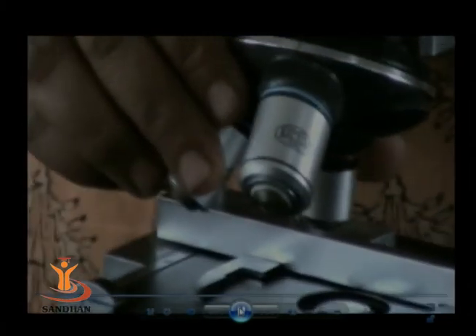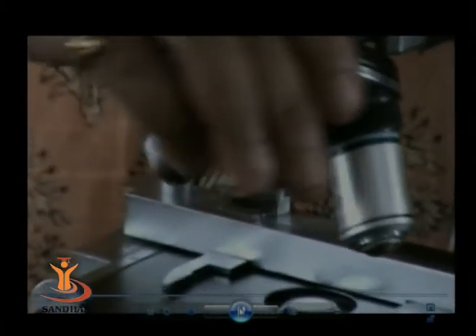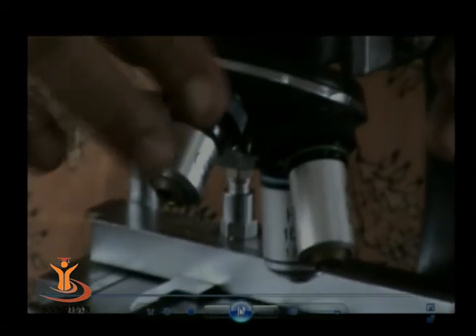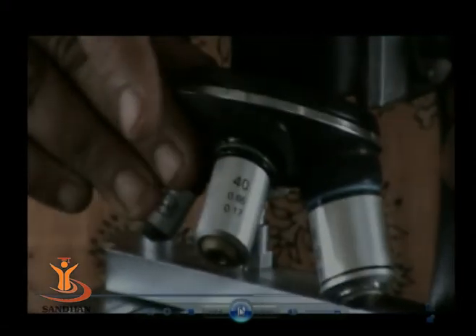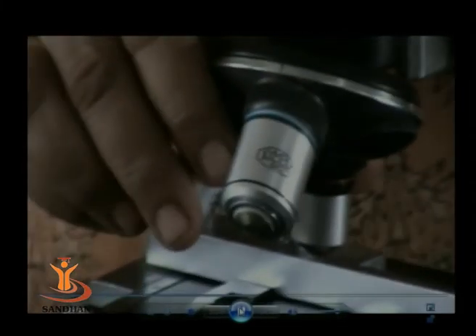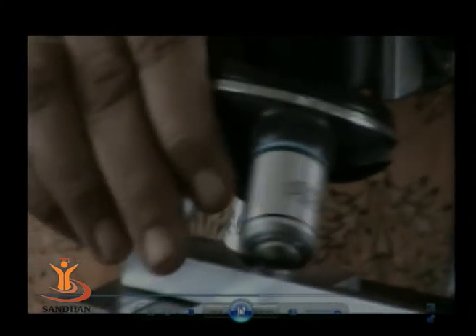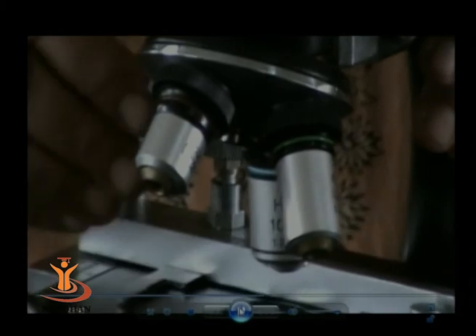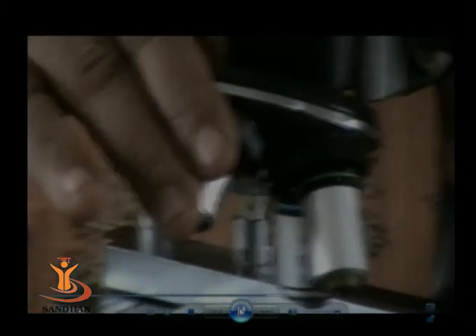This one is the high power objective, and this is the oil immersion objective. As you know, the three objectives have three different magnification powers. Low power has 10x magnification, high power has 40x, and the oil immersion lens has 100x magnification. This is called the objective lens because it remains close to the object that is mounted on the microscope, and that is why it is the objective lens.